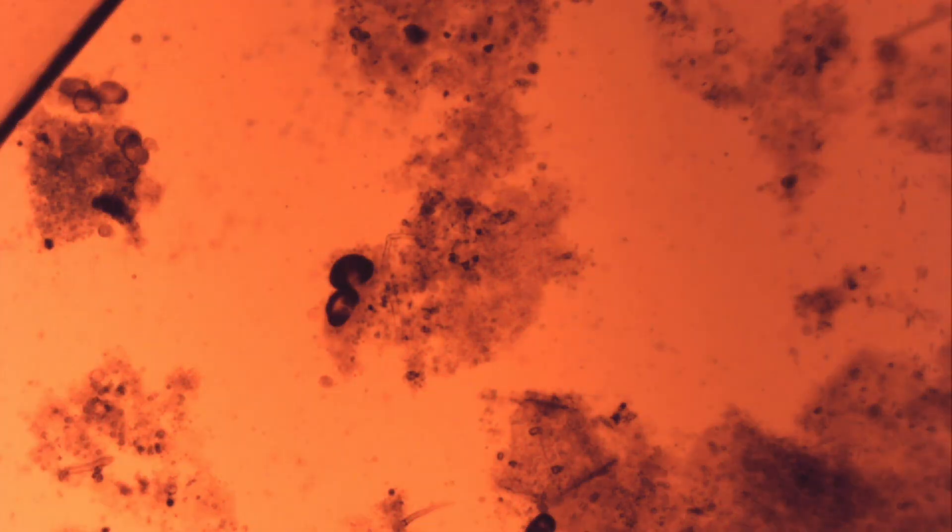First off, we will look at the pond water under a coverslip as is to get some better images of the organisms present.